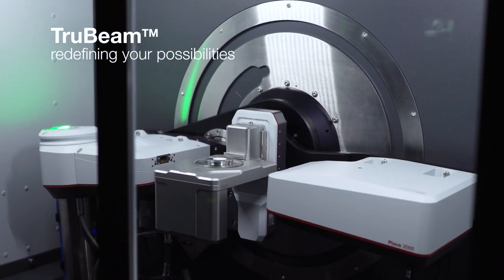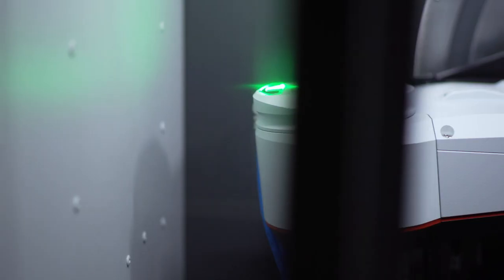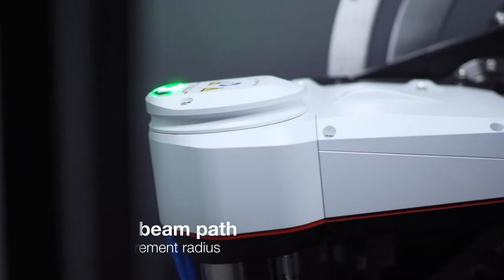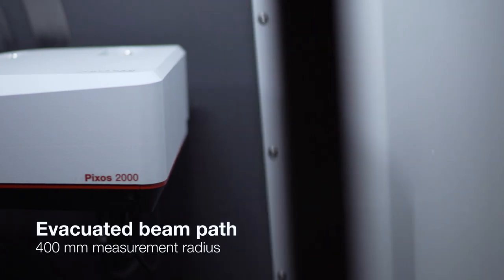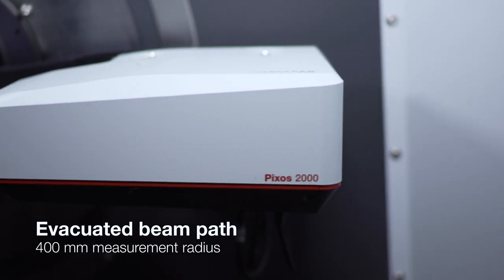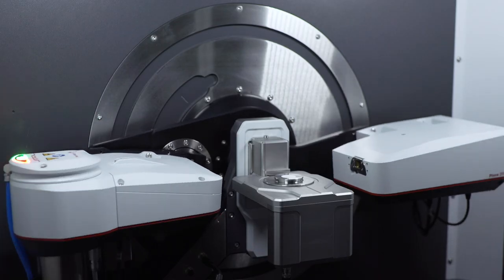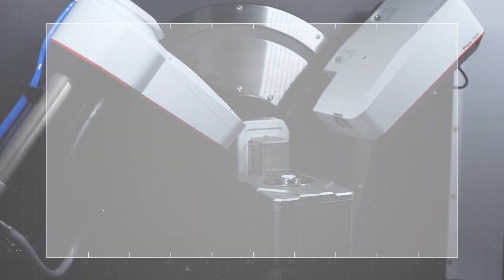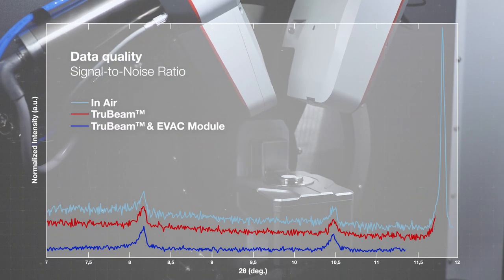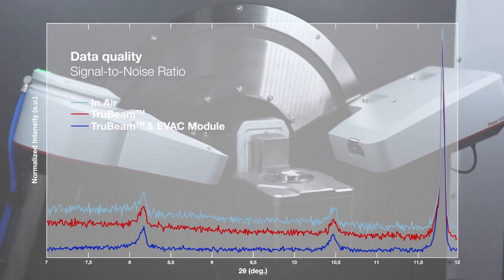Evacuated beam path and a 400 millimeter measurement radius provide you, for the first time ever, zero compromise on measurement speed and resolution for unmatched signal to noise ratio out of the box.